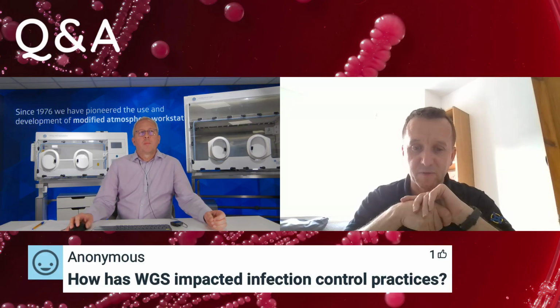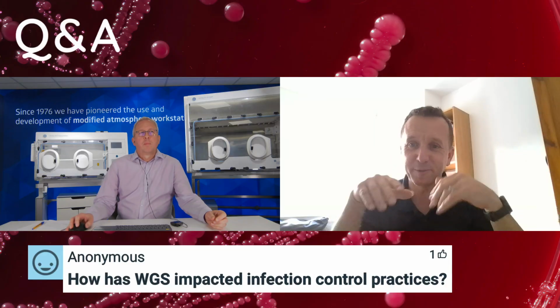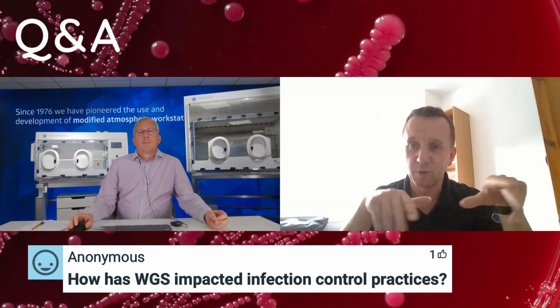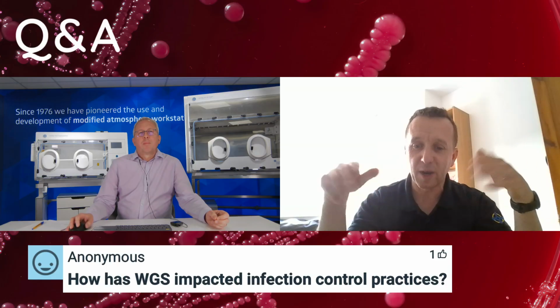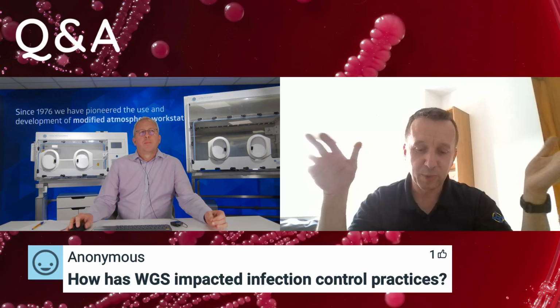So getting results within sort of an average of 7 days is fantastic for them in a positive and negative way, if you understand what I mean. So it's equally as valuable to be able to rule things out of an outbreak as it is to be able to rule them in and focus your investigation in the right way, because we're very conscious that within IP&C the pressures on time are huge.